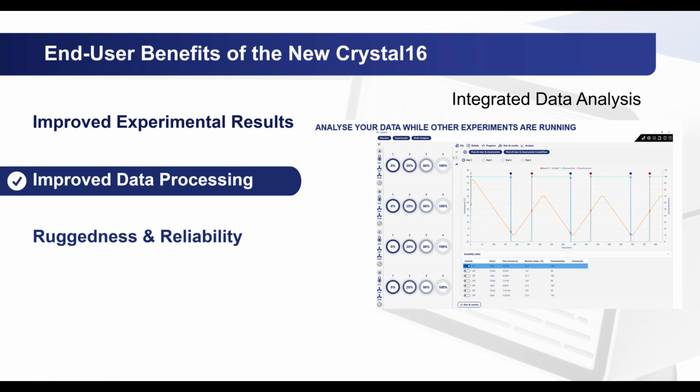And the beauty of it is that at the same time while I'm running experiments, I can now open other data from previous experiments or analyze the data of what is happening at that moment in my vials. And here, maybe you are used to seeing the clear and cloud points. These are all in this software. So now you can already assign the clear and cloud points from the software.